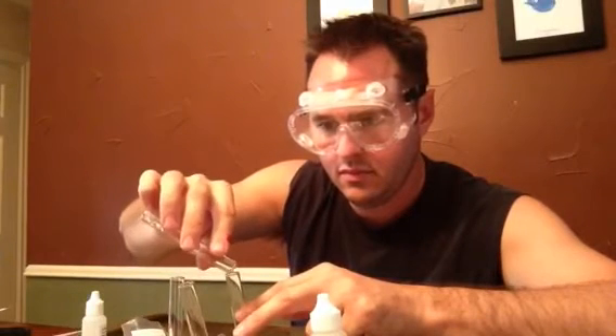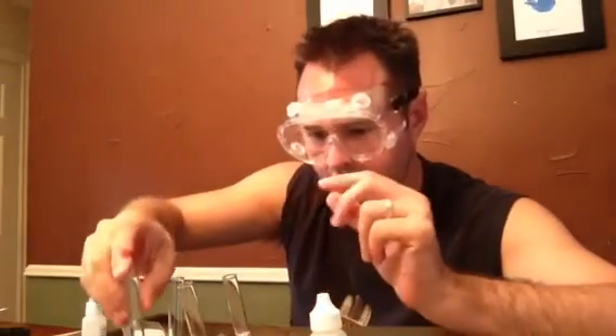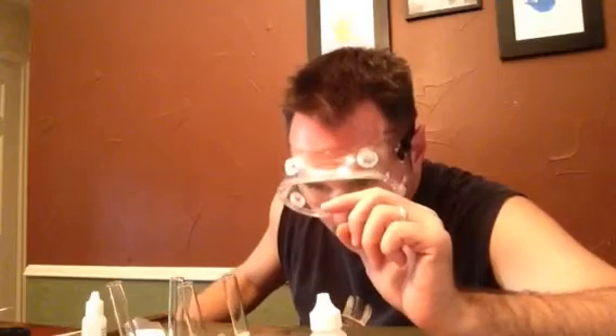They didn't tell me how much of the HCl to put in there. I've got the hydrochloric acid in my test tube. I've got the zinc here, I'm going to put that in there. Bubbles are coming up. That's neat.